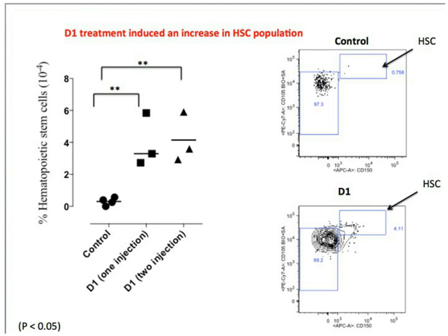They have been simply done using an image-based screening approach, and that has resulted in identification of 2 different compounds that produce an effect, one on stem-like cells from tumors, another on mouse embryonic stem cells and human embryonic stem cells, with 2 different effects, indicating that different cells have different unique features, and that can be very easily accessed by performing a simple image-based analysis.